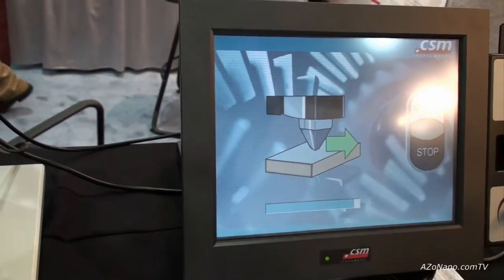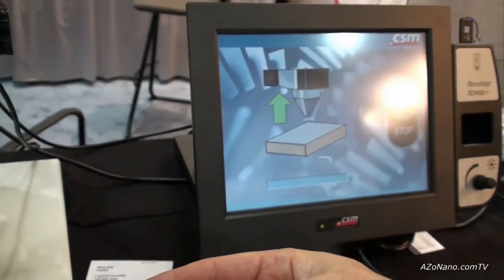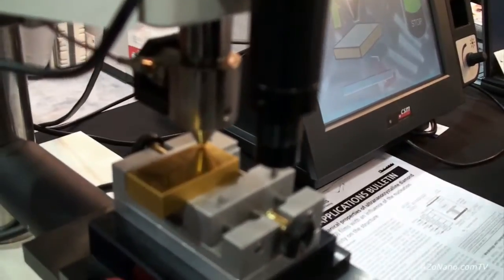So the scratch is just completing now. Once the scratch is complete we're going to unload the indenter and the sample will then move under the optical microscope which is integrated into the system.